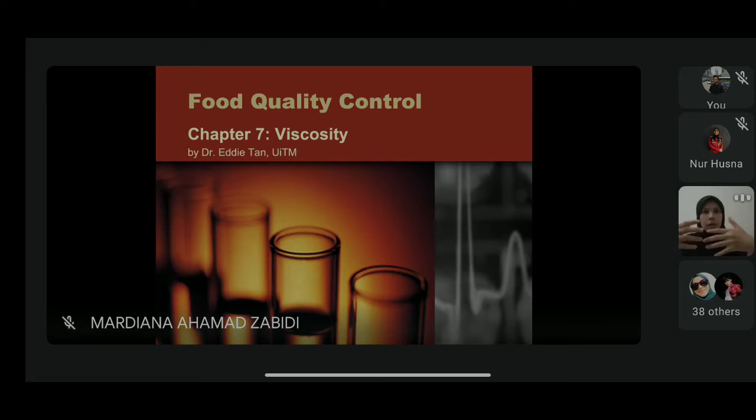All right. And then in terms of determination of viscosity, it will vary depending on the industry that you join. For example, if you are joining the milk industry, or those producing beverages, you are going to use a common viscometer that is known as a Brookfield viscometer. That viscometer is used to measure viscosity.